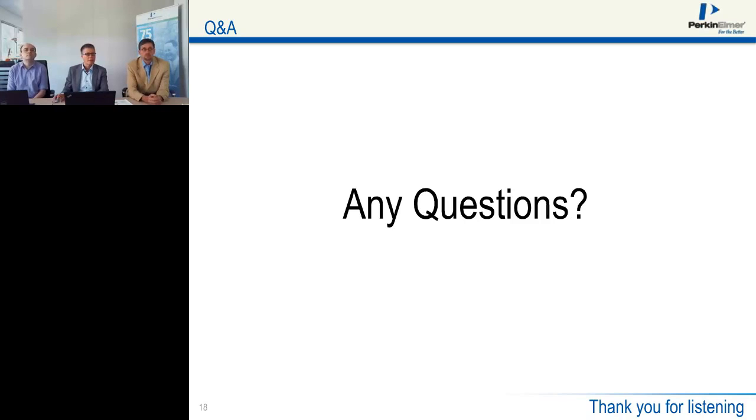I think the second question is around the same subject. Imaging is about 4 minutes per plate. What about the data processing and hit determination? How much time do you need in addition for that? Well, the image evaluation runs in parallel, and for all tests we did run so far, the image evaluation was as fast as the measurement. So the add-on time is just for the evaluation of the last 2 or 3 wells. That's a few seconds only. However, that may of course depend a little bit on the kind of evaluation that is running.